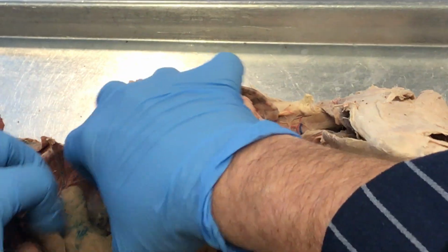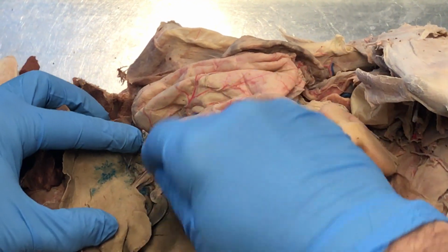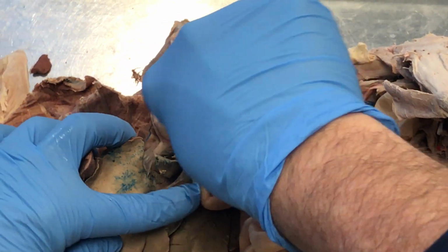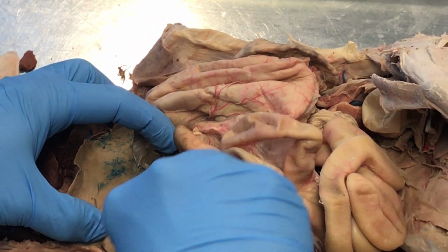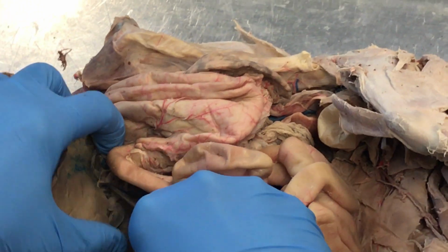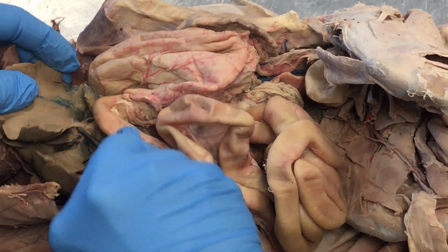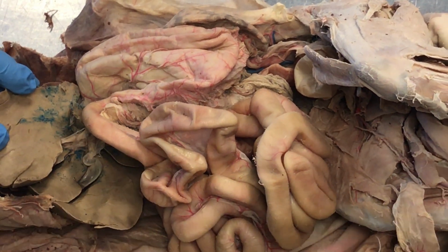Common bile duct. Sometimes you can see them if they've been dissected out. I'm not sure I see that it's dissected out on this one. But the common bile duct is going to run from the liver down into the first part of the duodenum. So I'm thinking it's going to be in this tissue right here. We want to be pretty careful. I dissected it out in another cat, but I don't think it's been dissected out in this one. The common bile duct is going to come from, that's probably it right about here. That structure right there, common bile duct.